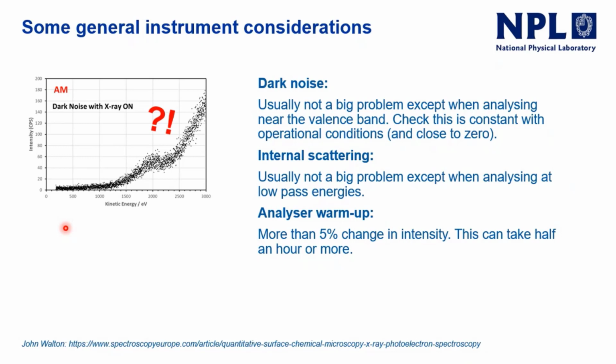You might, I don't know, do you have an equivalent of a discriminator these days? Can someone tweak that up a bit? An engineer, call up Kratos, please change my discriminator setting. Yeah. Software, rather than pop. That's dark noise with the X-ray on. Yeah, so that's with no sample in. Actually, the same thing happened with the X-rays off for this particular instrument. It's not a Kratos instrument, don't worry.